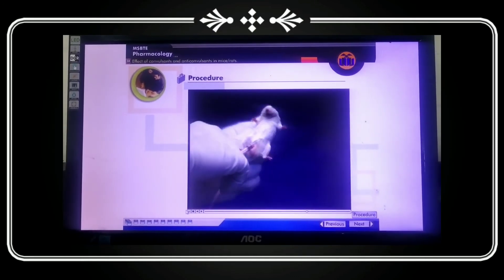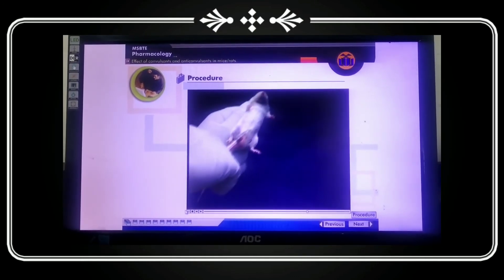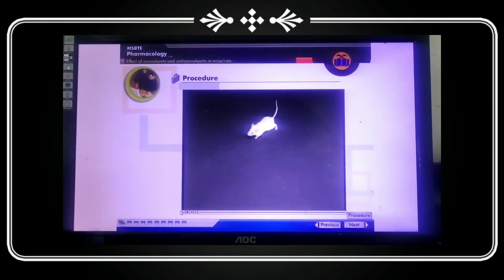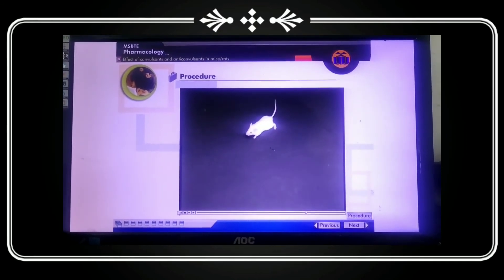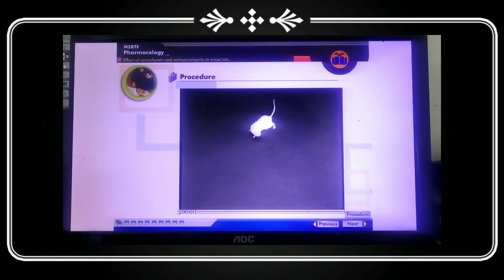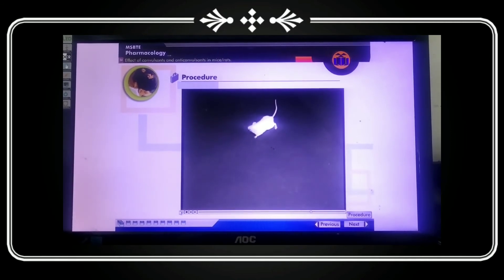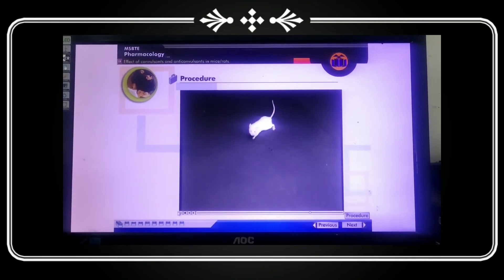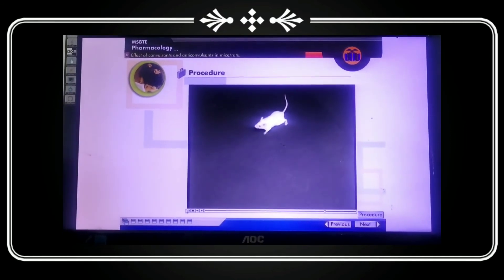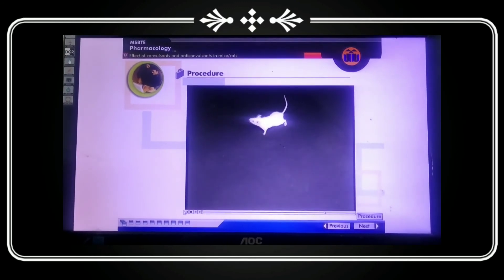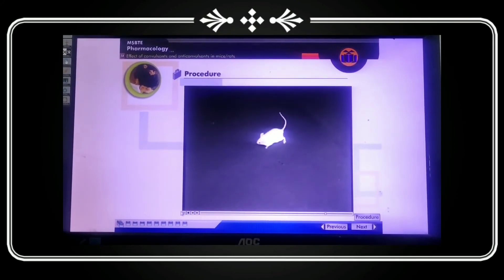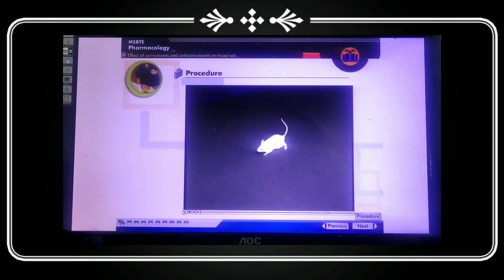After giving the anti-convulsant drug, the animal becomes normal. You can observe this animal now — the convulsion has been removed with the help of the anti-convulsant drug diazepam. It is now showing normal activity.